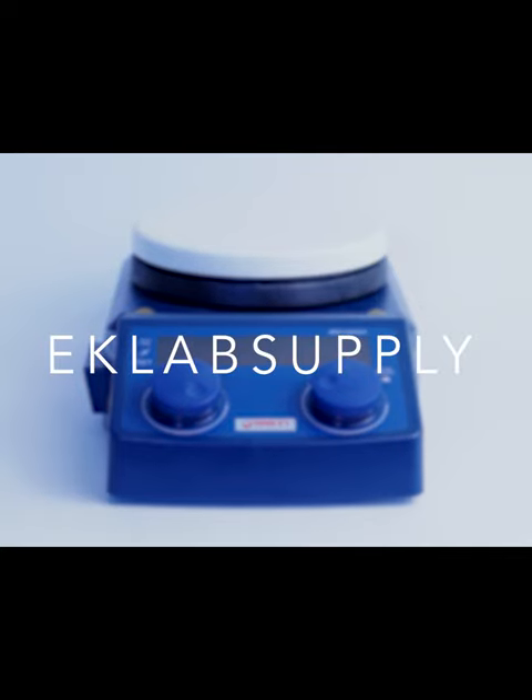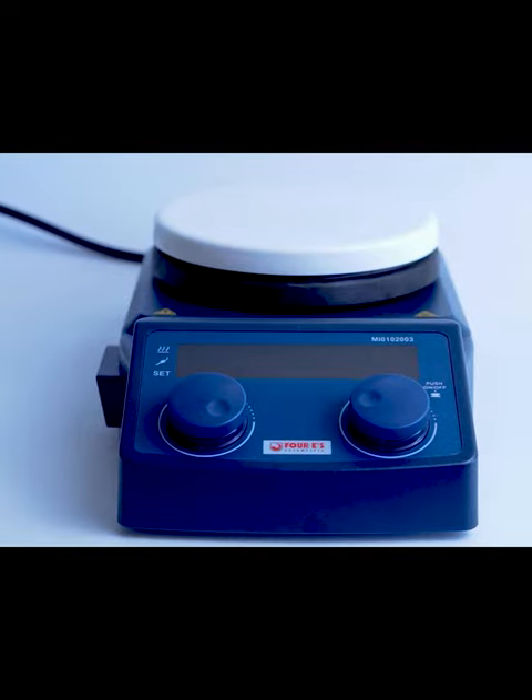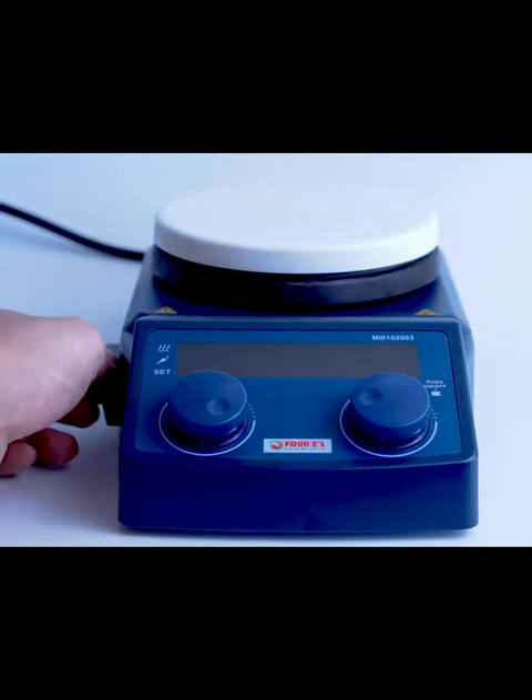This is a tutorial on how to use the LED digital magnetic hot plate stirrer. The first step is to turn on the machine, which is done using the on and off button.